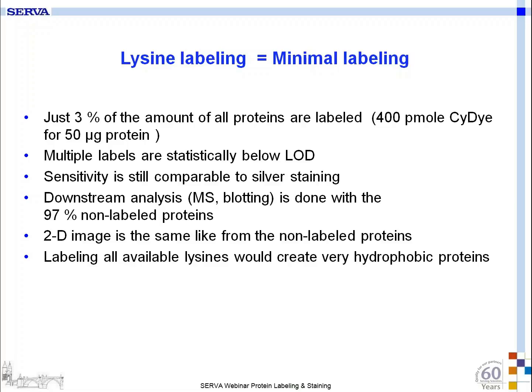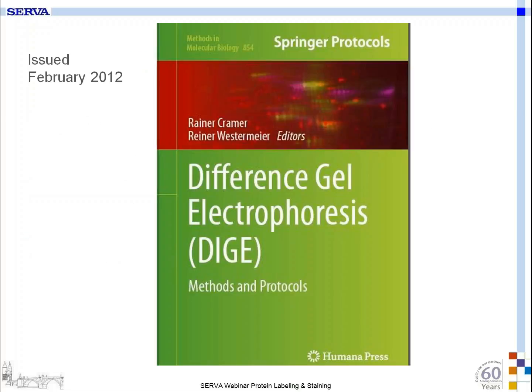The labeling of all the lysines would create very hydrophobic proteins. And just if you are not sure you understand that, you can of course ask us afterwards.